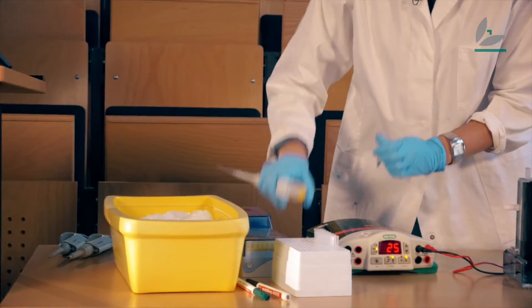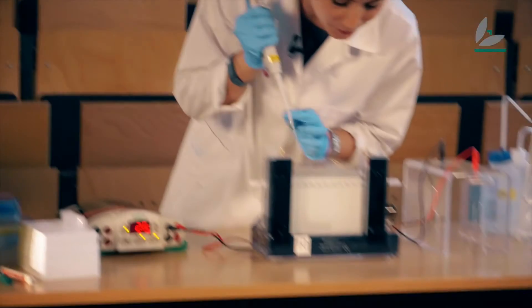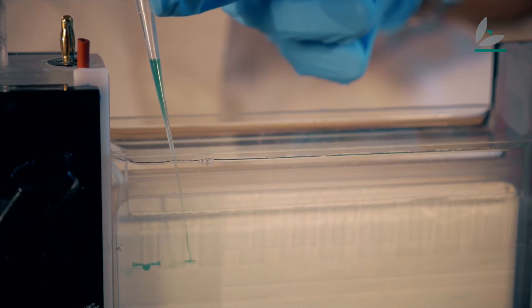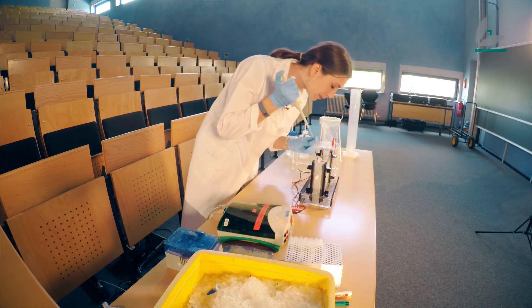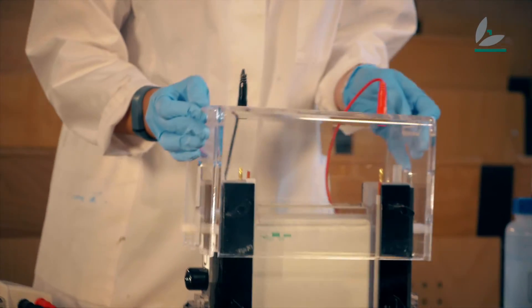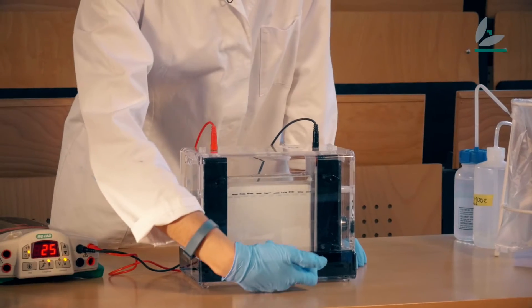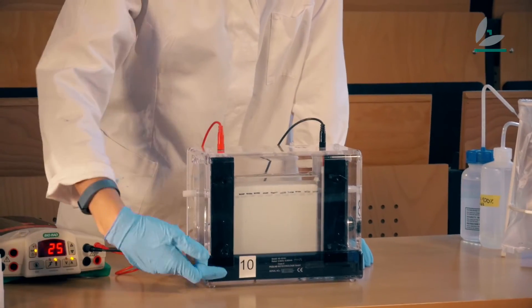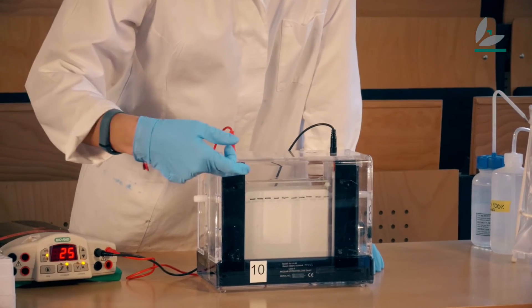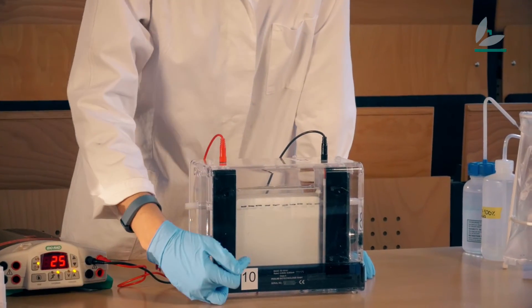So I will load my proteins now into the gel. My proteins are negatively charged, so when I switch on the current they will run through the gel to the positive electrode. The positive electrode is on the lower part and the negative electrode is on the upper part, and that's why the proteins are going to run through the gel to the positive electrode.